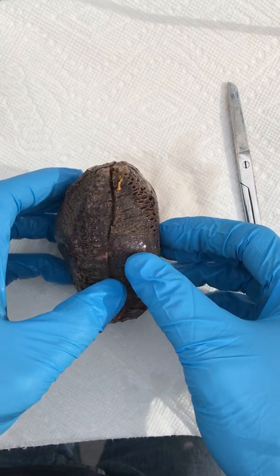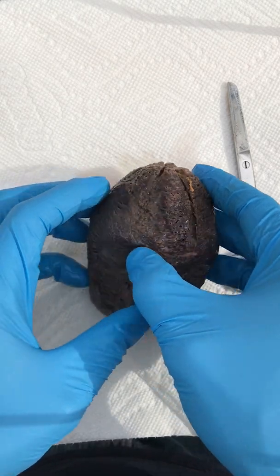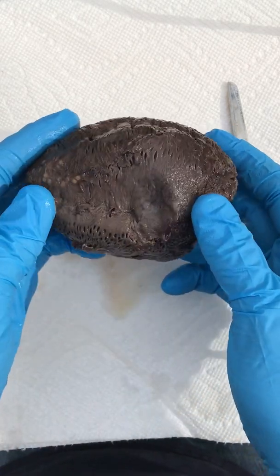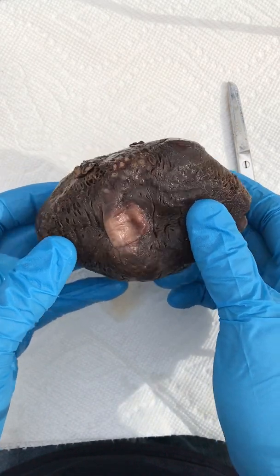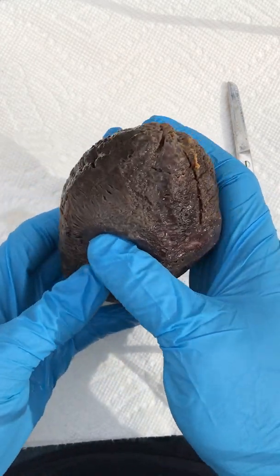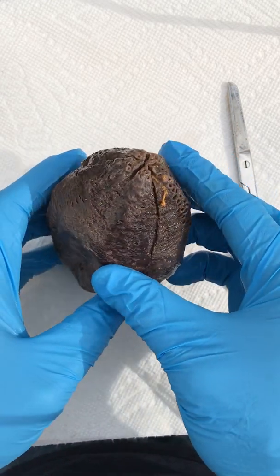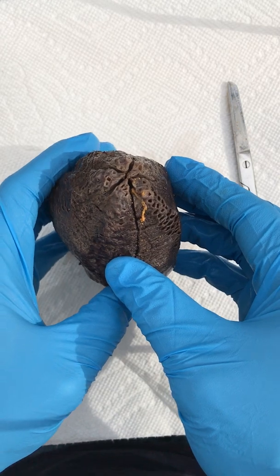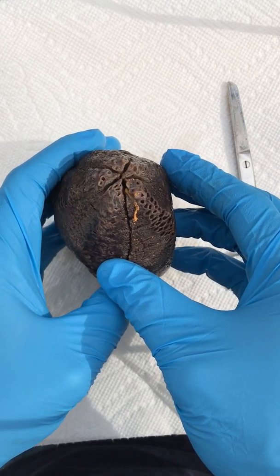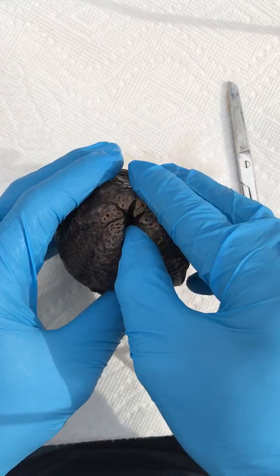All right everyone, I hope you're doing okay with the remote learning experience. We have a sea cucumber here. It has its name because it looks sort of like a cucumber. This is an echinoderm in the Phylum Echinodermata, Class Holothuroidea. And here is the mouth — the opening to the mouth.